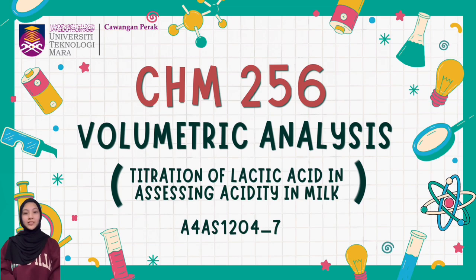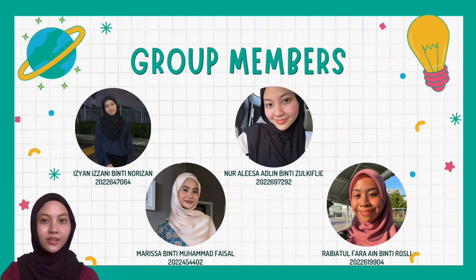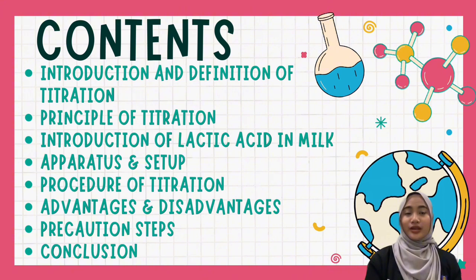A4AS1204_7 will be presenting about volumetric analysis, titration of lactic acid and assessing acidity in milk. My name is Nur Aleesa Adlin alongside with my group mates Izyan Izzani, Marissa and Rabiatul Fara Ain. Today, we want to discuss about introduction and definition of titration, principle of titration, introduction of lactic acid in milk, apparatus and setup, procedure of titration, advantage and disadvantage, precaution steps, and conclusion.